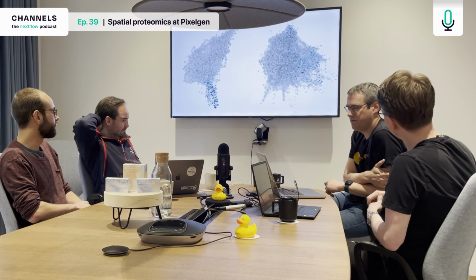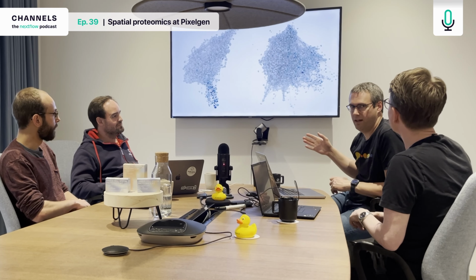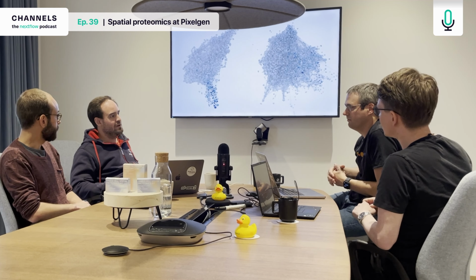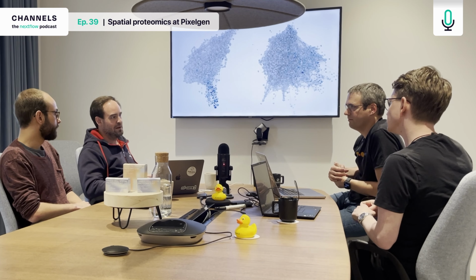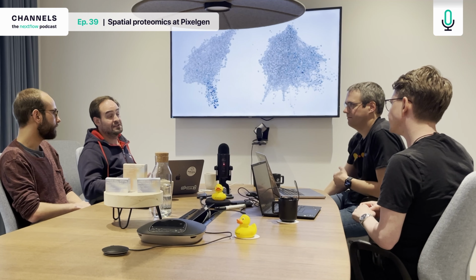Sorry, one thing I was going to ask you. This is single cell resolution, but how many single cells can you do in a single experiment? In the current product, 1,000. But obviously, the experiments you would plan would be more than 1,000, because you would plan a control as well. And that's actually what we recommend.